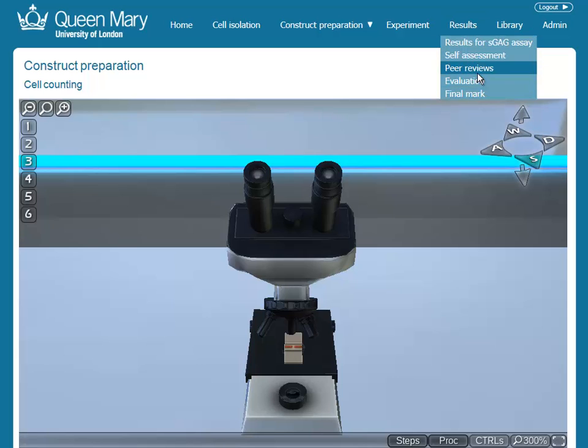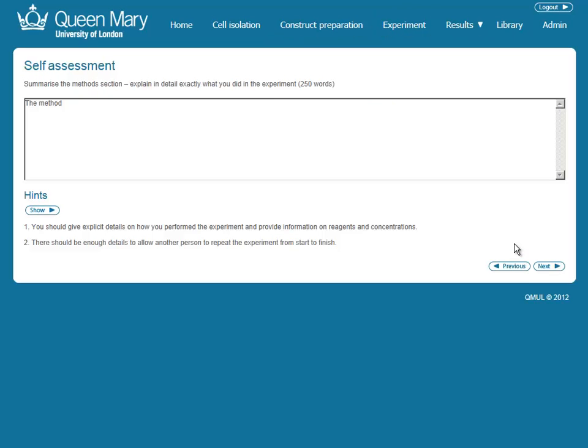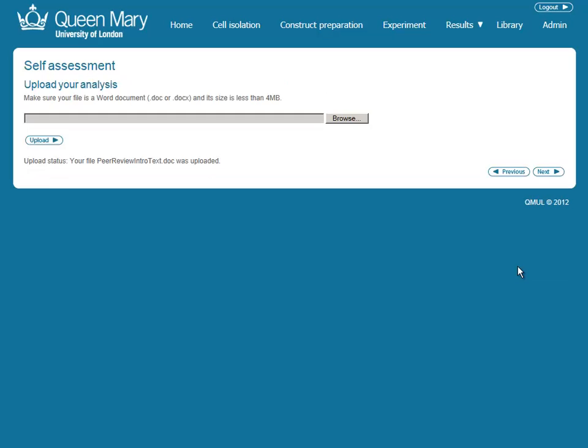Once students have completed all the labs and exercises, the QMUL Virtual Tissue Lab also includes self-assessment and peer review facilities, where students can analyse the results they have seen and review the work of their peers before they receive their final mark.